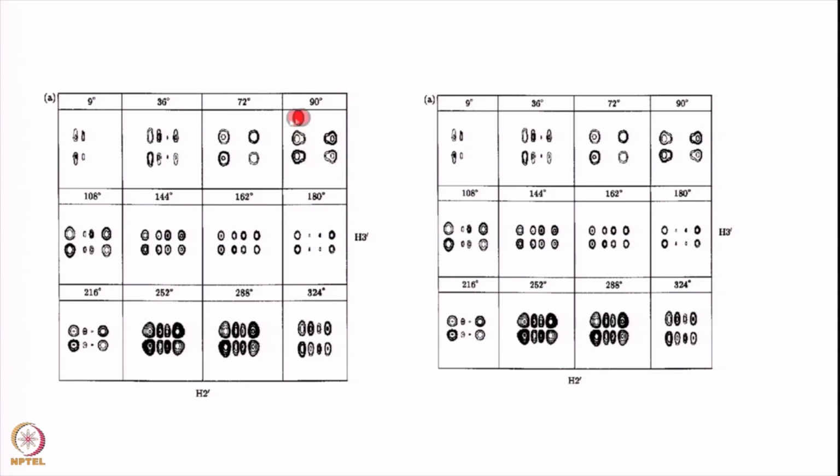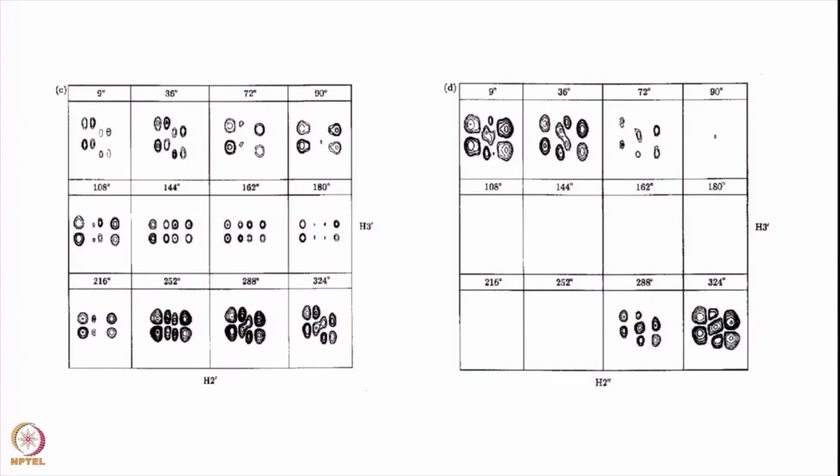Of course, this software was written for simulation purposes, and all this data is already published in Progress in NMR Spectroscopy, and you can make use of it as the database. You calculate this pattern, compare it with the experimental spectra, and you can estimate the sugar geometries. Now this is for the 2'' 3' peak.